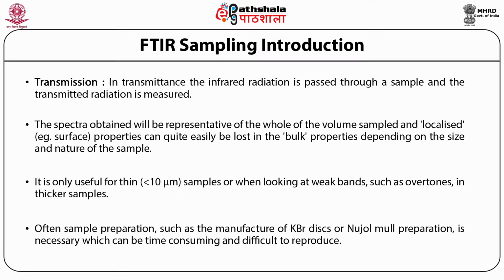Often sample preparation, such as the manufacture of KBr discs or Nujol mull preparation, is necessary, which can be time consuming and difficult to reproduce.